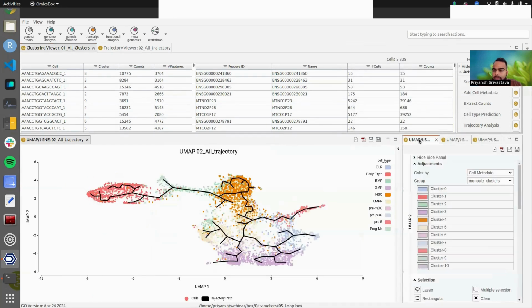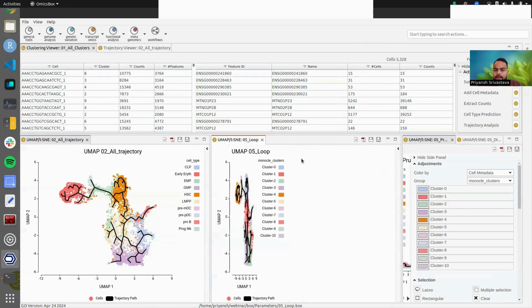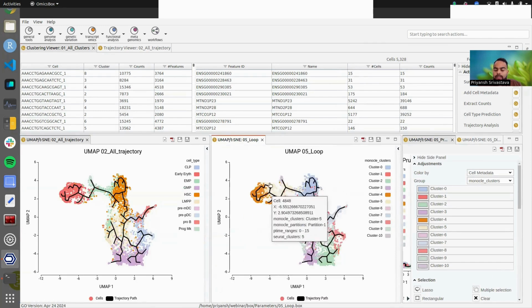And then we see this one, let's say. Okay, so what this represents is cyclical structures. So you can tell Monocle, okay, I may have some cyclical trajectories or some patterns which are oscillatory in nature, so try to look for them. So for example, if you enable that parameter, what you end up having is the cyclical structures if they exist in your data set. For example, by default, you learn a trajectory like this, but in the case where you have that kind of expression patterns, then it will try to learn these circular trajectories.